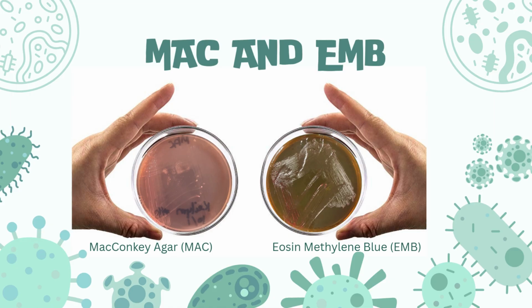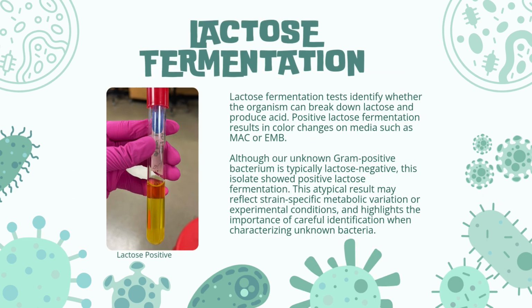One, the organism is not truly Gram-negative because it did not thrive. And two, it may have some ability to tolerate the inhibitory components of this media, something occasionally seen in Gram-positive cocci like Staphylococcus species.